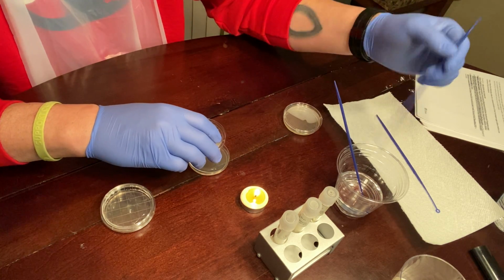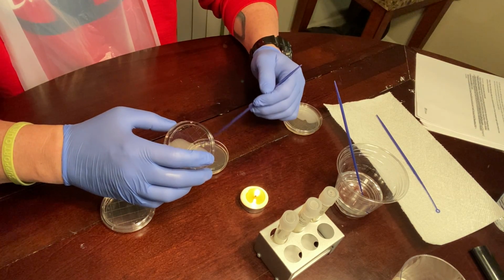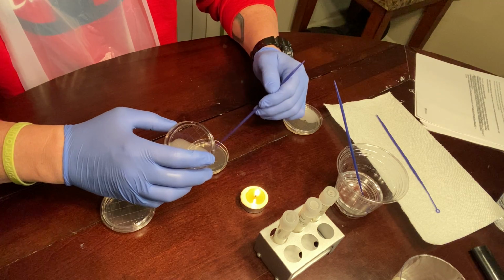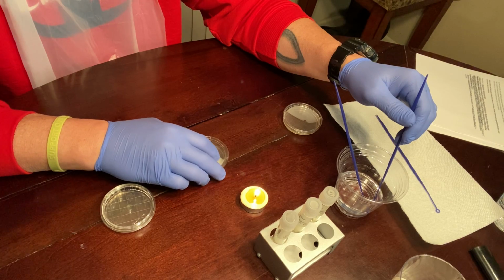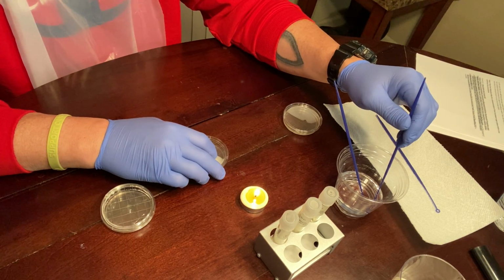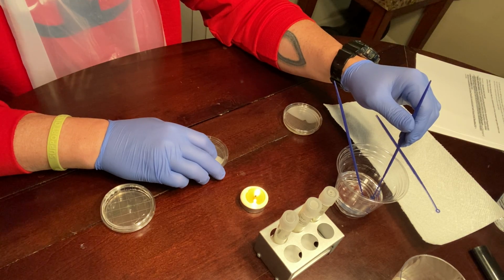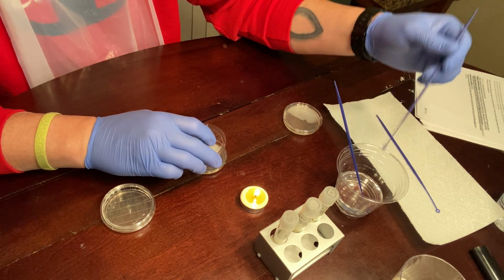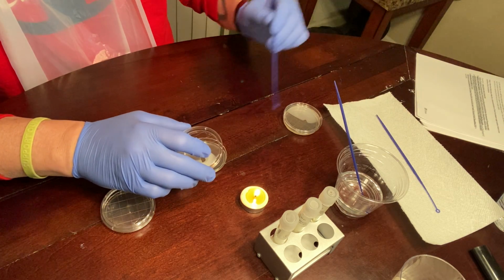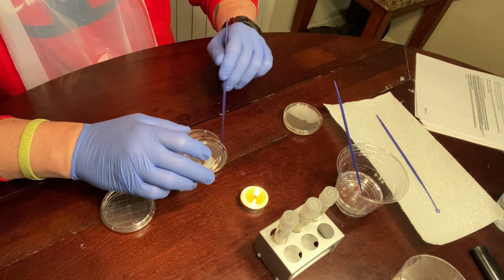30 seconds. So I'm going to borrow again from one and zigzag into another quadrant. So I'm going to borrow from two and zigzag again in the third quadrant.